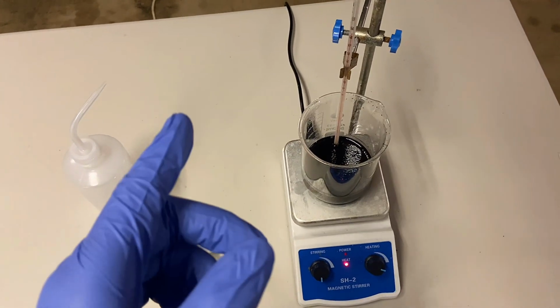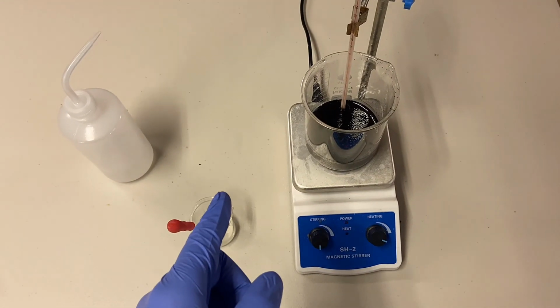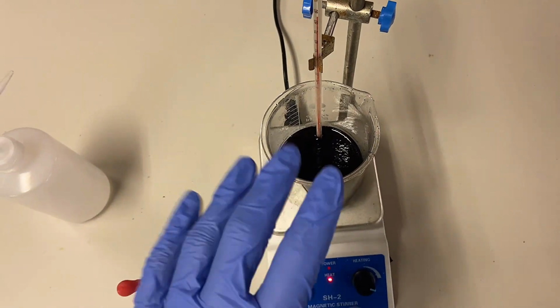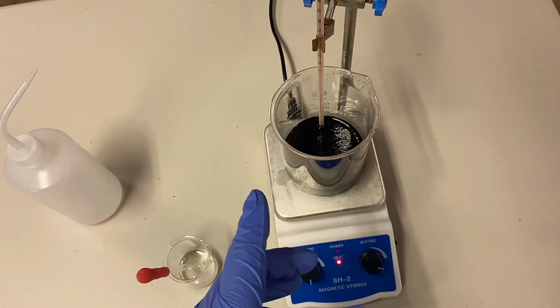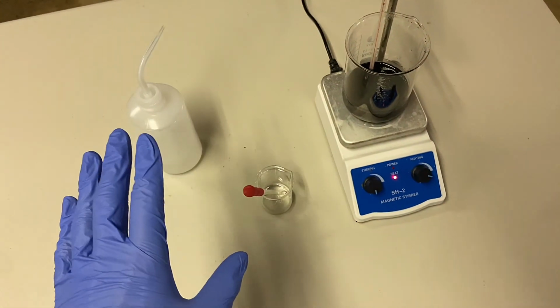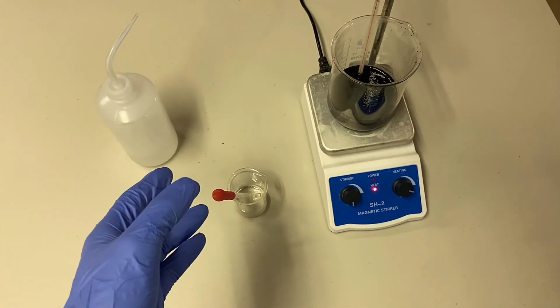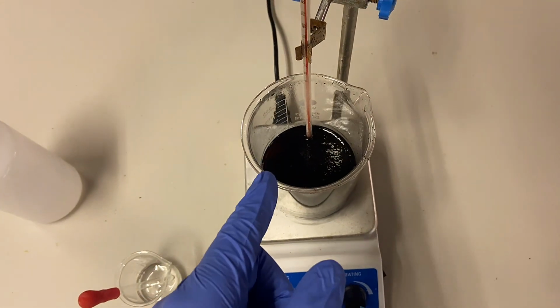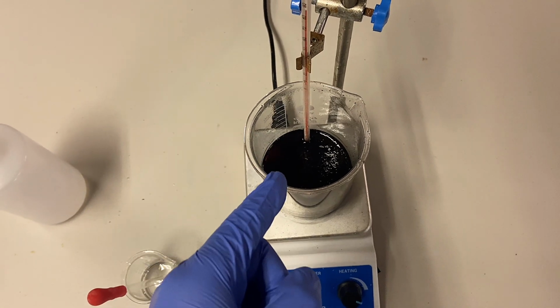I am back with another vape recycling vlog. This time I'm looking back at all the battery recycling chemistry stuff. What I've done is I've taken the black mass from the previous video, the stuff that we purified using a really strong base, and I've started to dissolve it up in some very powerful acid.